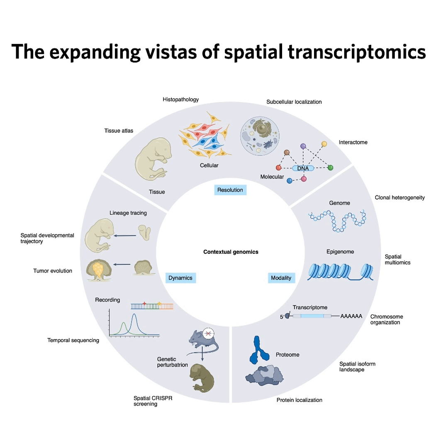Okay, let's dive a bit deeper then into sequencing-based ST first. The way they actually create those surfaces with the tiny barcoded pixels. That sounds incredibly clever. Lots of different engineering tricks. Oh yeah, there's a lot of ingenuity there. But the central idea for all SST methods is creating that spatially indexed surface. We can sort of simplify the engineering approaches into maybe two main categories, often differing by the resolution they achieve. The first category uses deterministic printing. Like a very, very precise, high-tech robotic printer. Exactly like that. Methods like the popular Visium platform use automated microarrayers. These are essentially robots that very precisely print unique location barcodes onto defined spots on the slide surface.